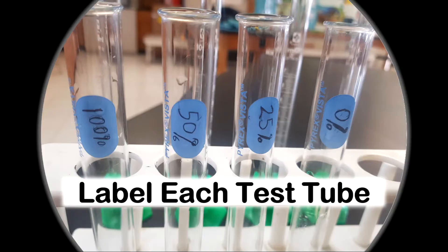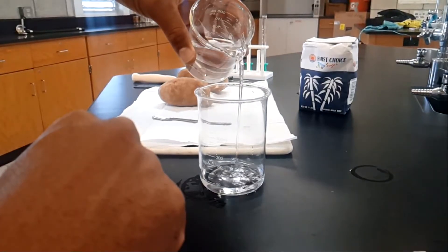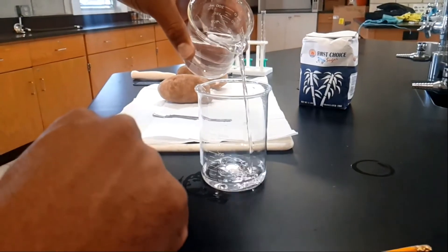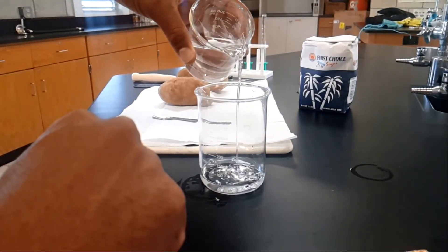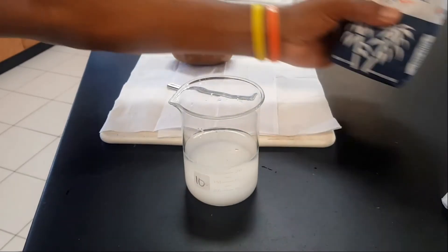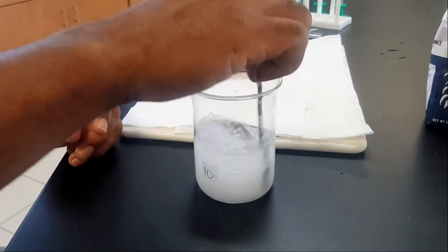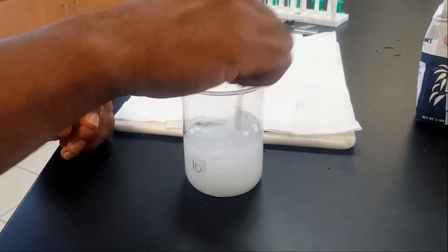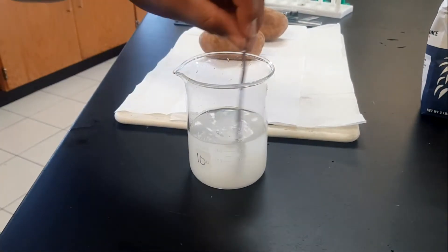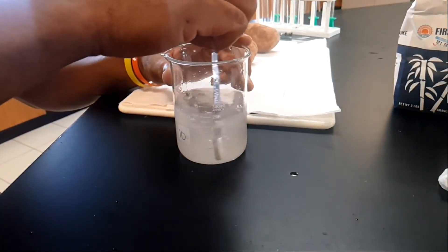Once you finish labeling your test tubes, pour some water slowly into your beaker. Once you have the required amount of water, add some sugar — add enough until no more sugar can be dissolved. Give it a really good mix and make sure you see some sugar particles at the bottom of your beaker. Once you mix that thoroughly, you're ready to go to your next step.